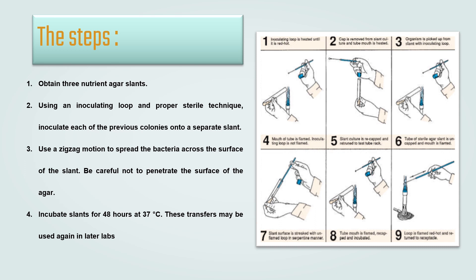This technique uses a zigzag motion to spread the bacteria across the surface of the slant. Be careful not to penetrate the surface of the agar. Lastly, incubate the slants for 48 hours at 37 degrees Celsius. These transfers may be used again in later labs.